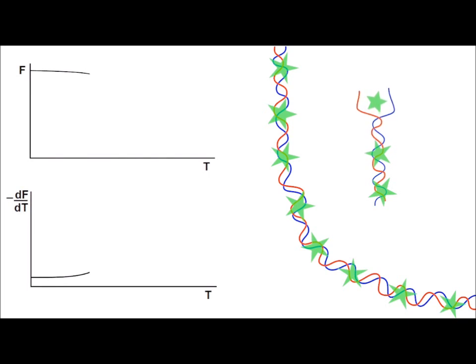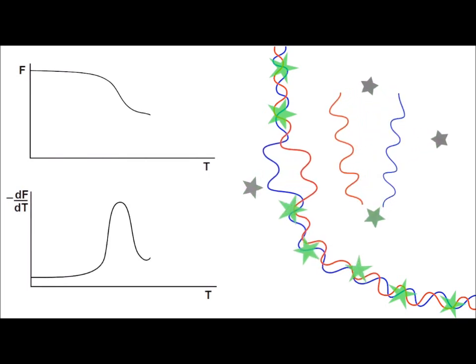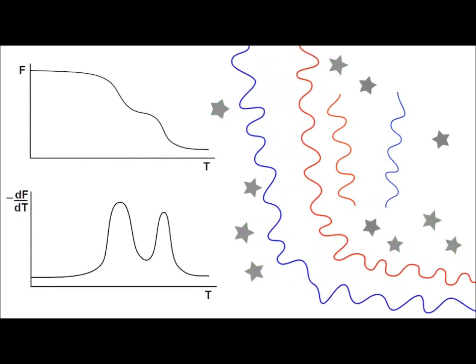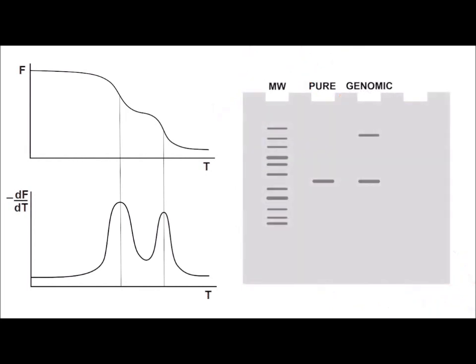Denaturation of the genomic DNA occurs after the melting temperature of the target due to the large size of the genomic DNA, hence producing a second, later peak in the melt curve. This contamination results in a slow band in the gel corresponding to the genomic DNA.